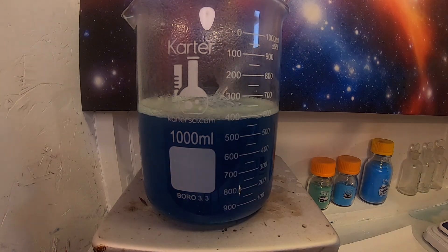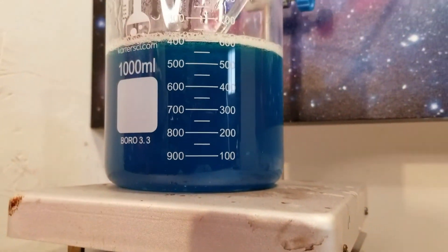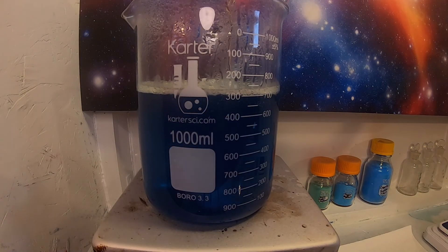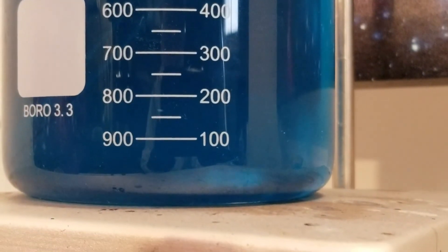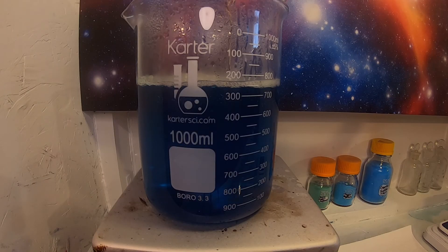You want all of the copper carbonate to react, leaving an excess of acetic acid. So over time I keep adding small portions of acetic acid, until it seems like all of the copper carbonate is gone, then add a touch more to be safe.